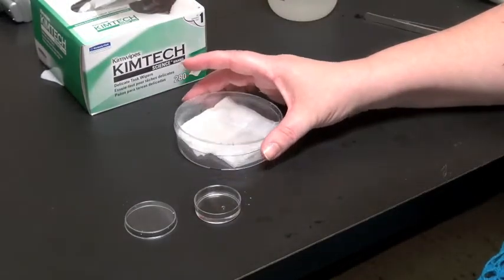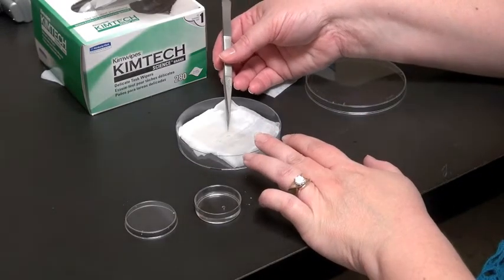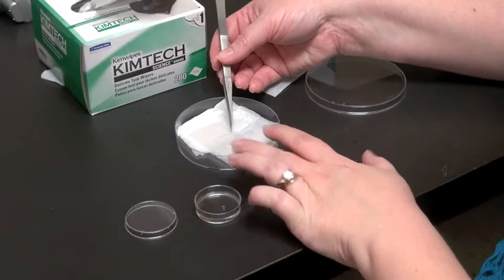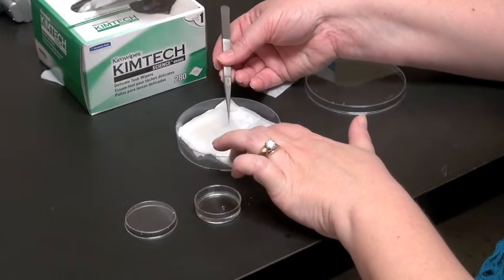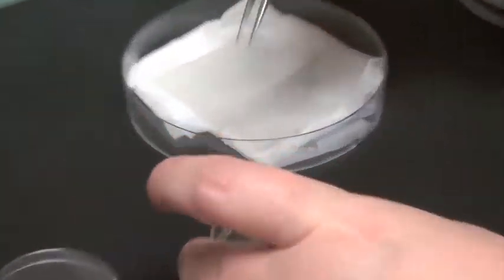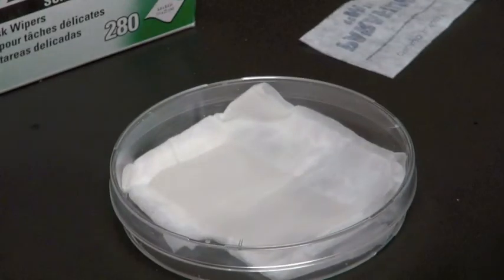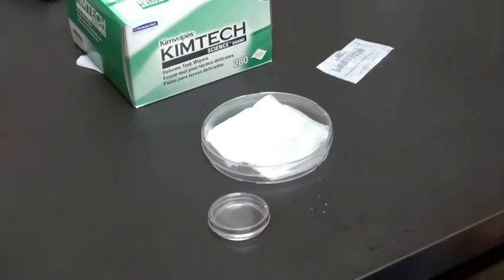Once your staining is complete, you transfer your cover glass back to your wash chamber and proceed with your staining. You can reuse your humid chamber water, or you can throw it out.